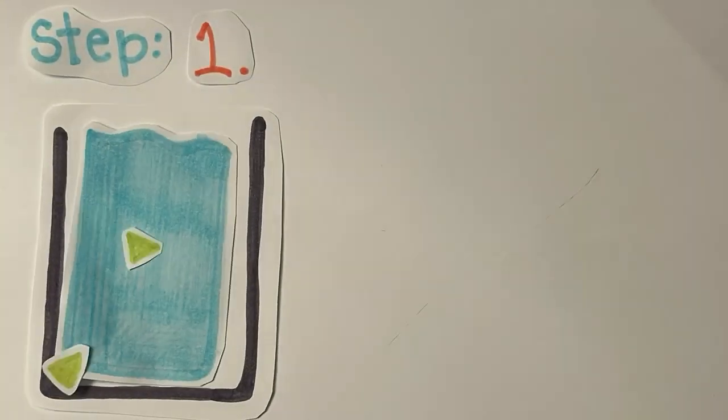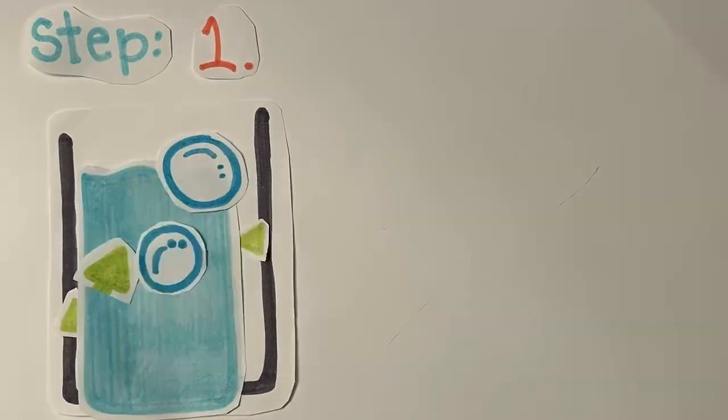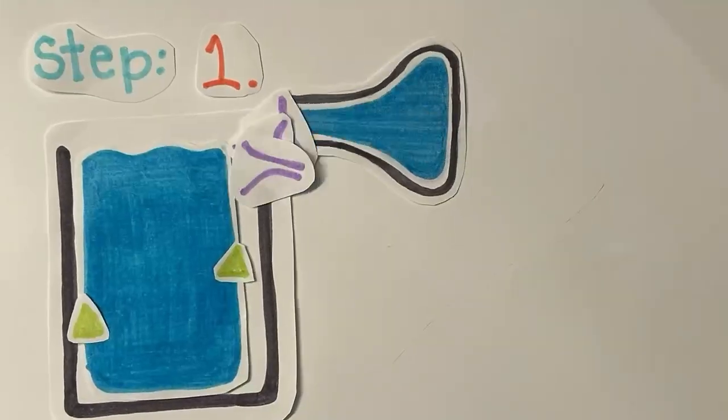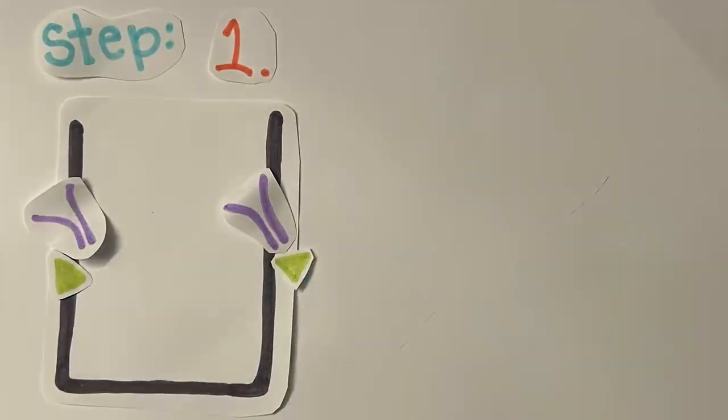In step 1 of ELISA, an experimental sample such as blood or saliva is added to a well. The proteins bind to the well wall, and then detergent washes out the unbound proteins. A primary antibody is then added to the well, which binds to a matching antigen from the experimental sample. The unbound primary antibodies are then washed away.